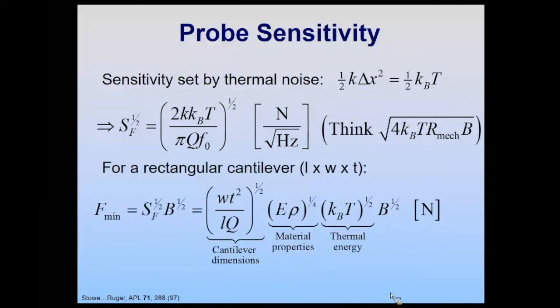Well, if you have a rectangular cantilever, some length, some width, and some thickness, the minimum force that you can measure depends on the cantilever dimensions. It depends on the material properties, like the Young's modulus, and it depends on the thermal energy. And it depends on the bandwidth that you're willing to narrow your measurement down to.